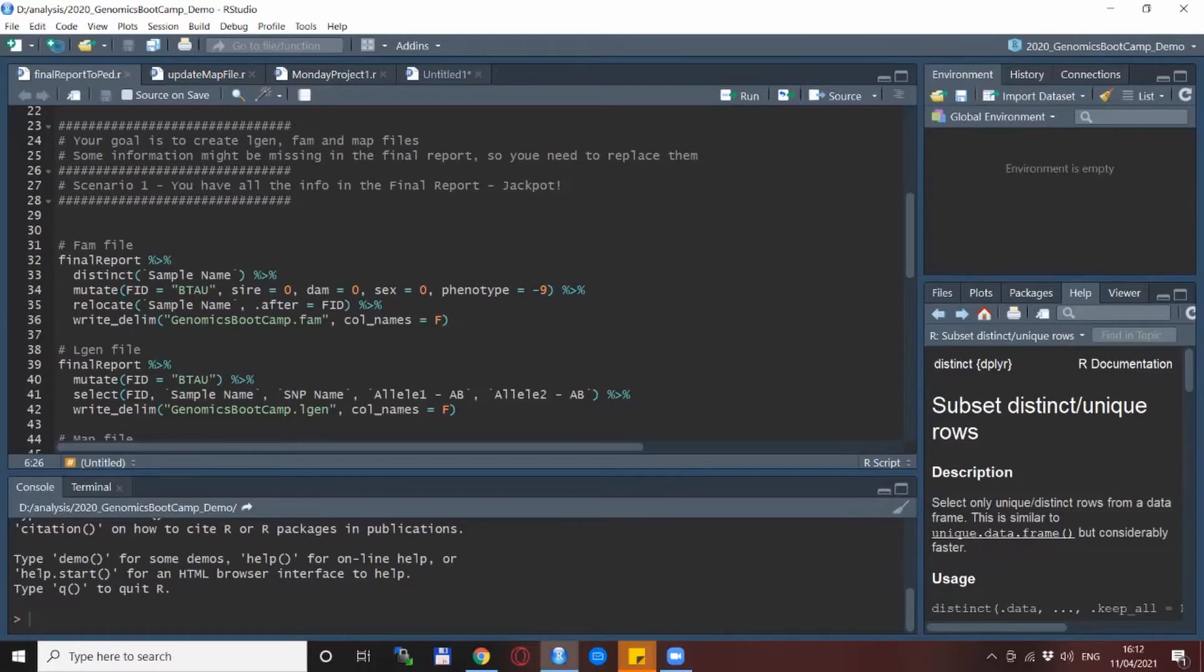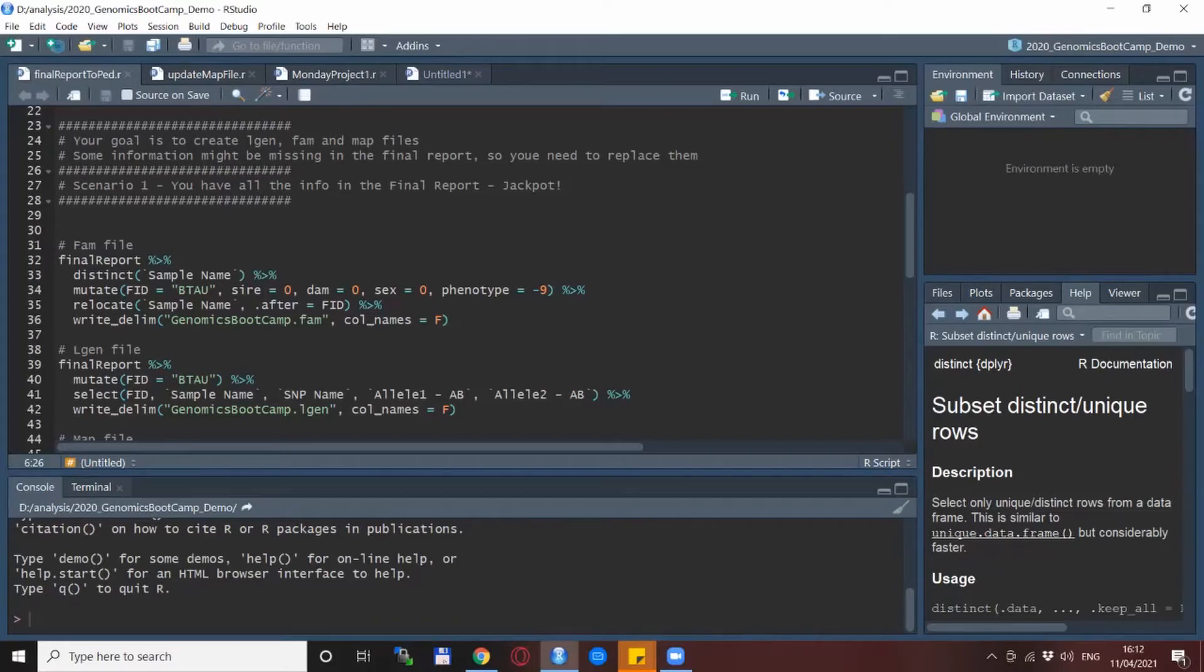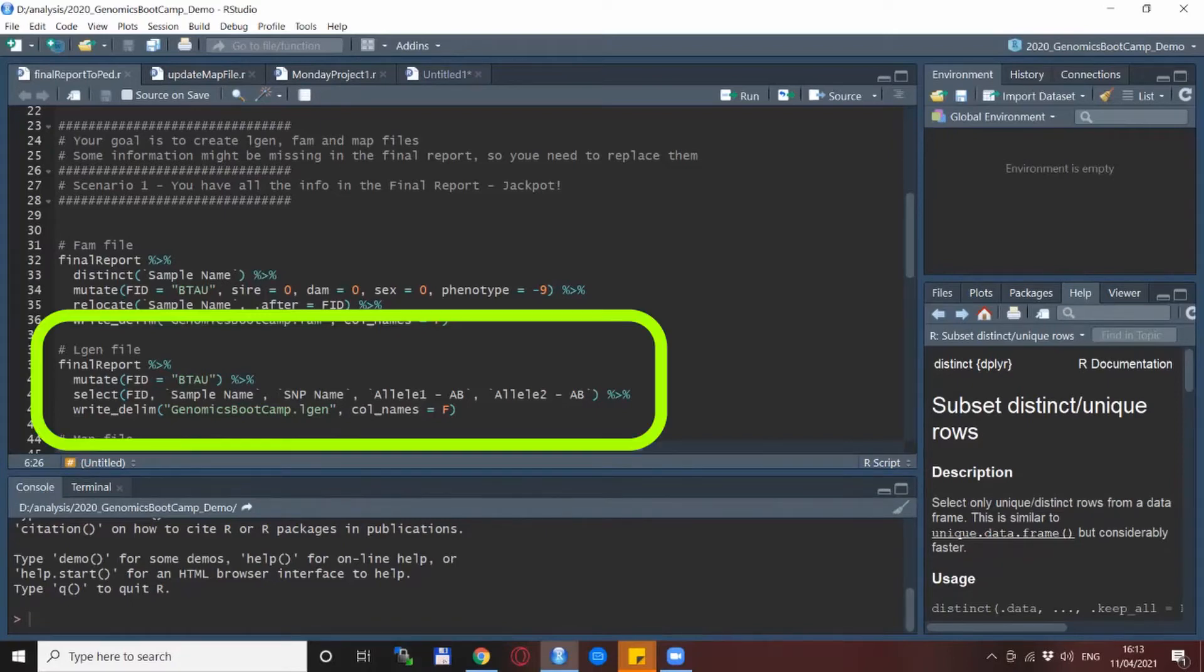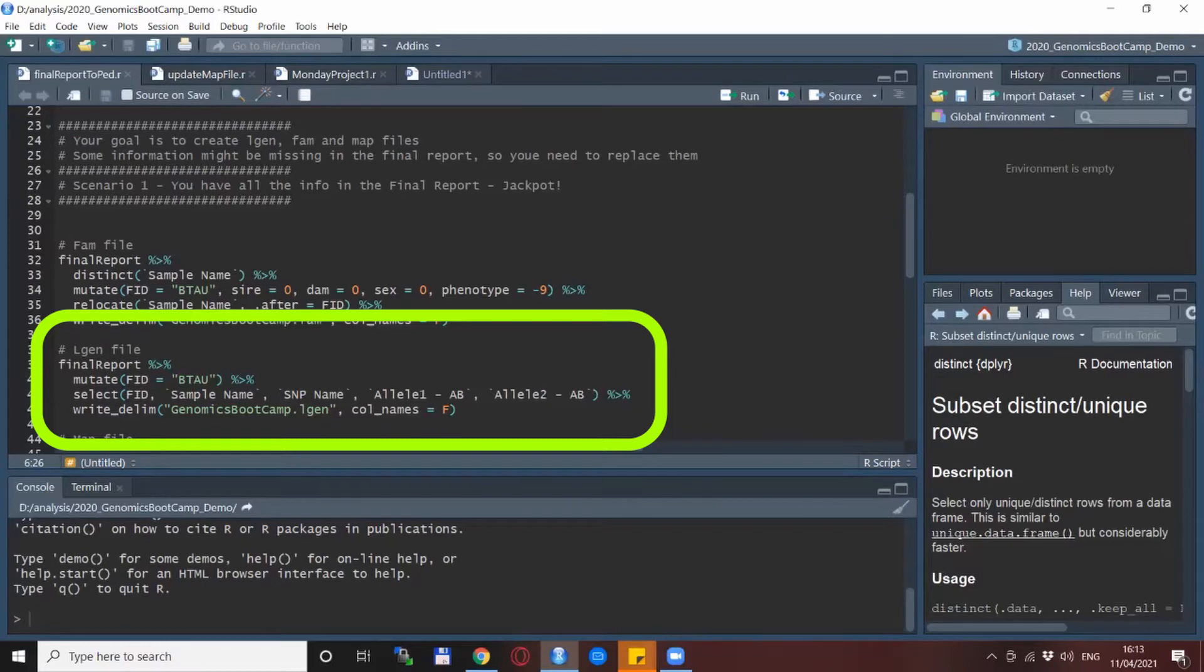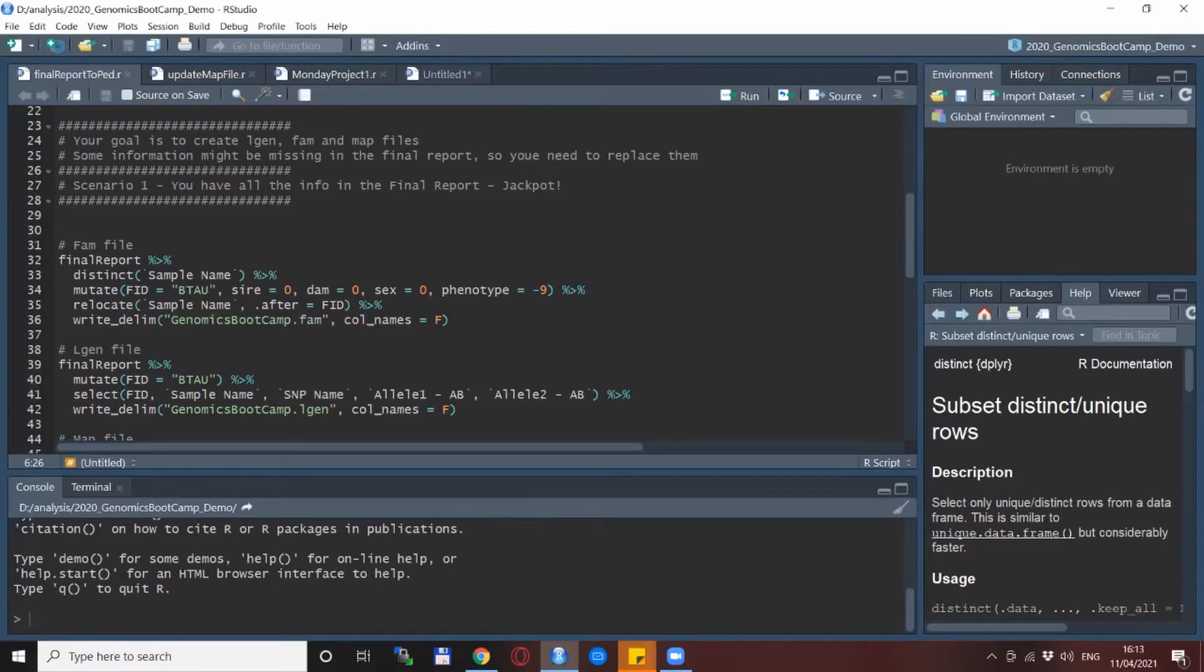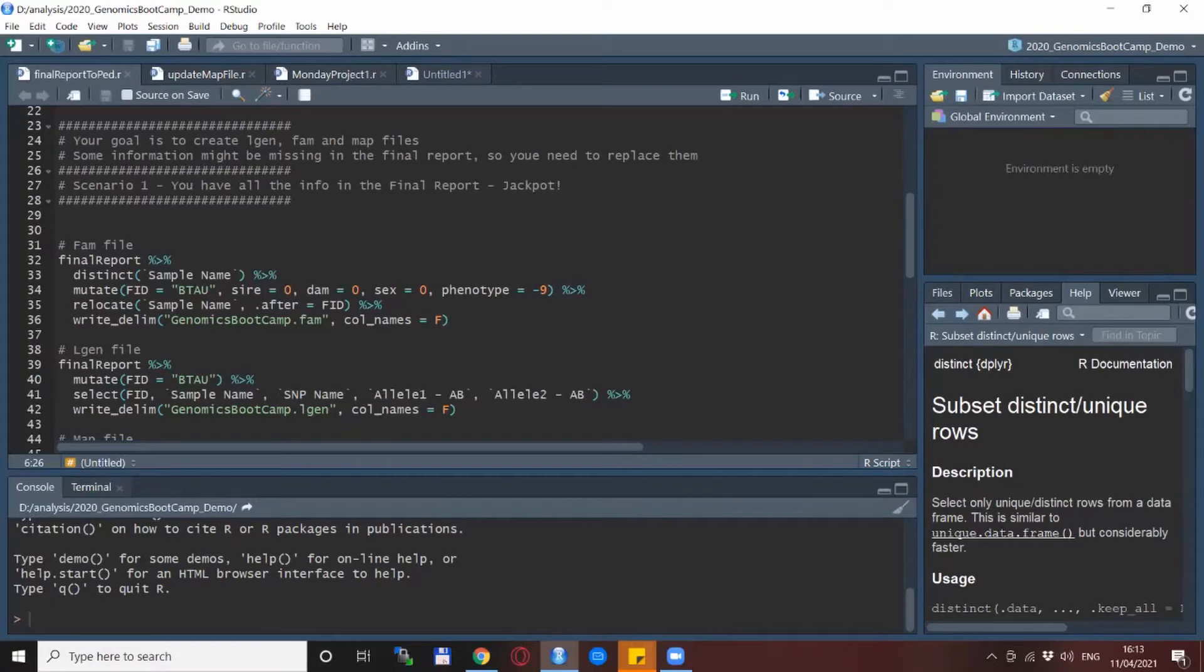The largest part of the data is in the LGEN file. So this is the file that we have one line per one SNP per individual and you remember I told you that almost everything is already available in the final report itself. So basically we start with the final report, add again the family ID and then select the columns that we need.